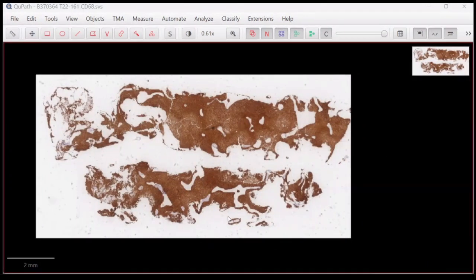M5, and then CD34. In the classical acute M5 leukemia, this is known for the fact that CD34 and CD117 are negative. Yeah?